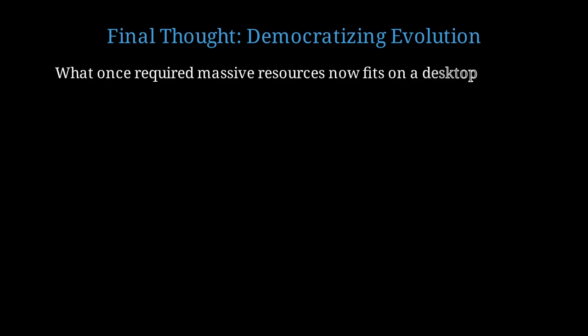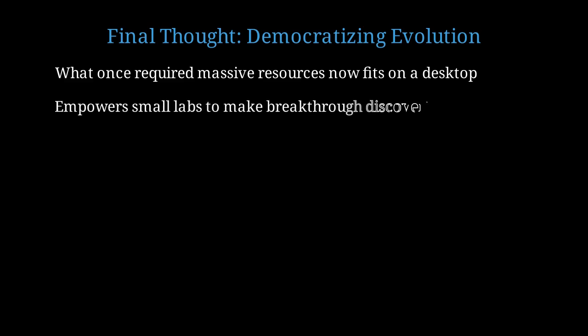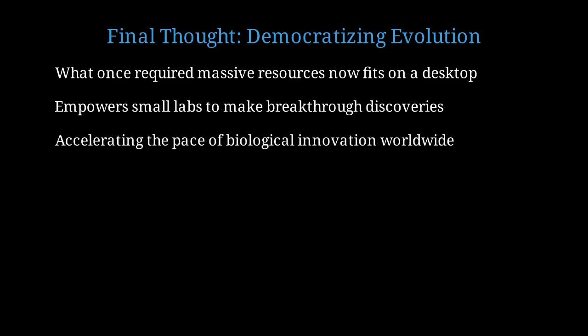Here's a final thought to leave you with. Droplet microfluidics is democratizing directed evolution. What once required massive industrial-scale facilities and millions of dollars now fits on a desktop and costs thousands of dollars. This empowers small, academic labs, startups, and researchers in developing countries to make breakthrough discoveries that were previously only possible for large pharmaceutical companies. We're accelerating the pace of biological innovation worldwide.